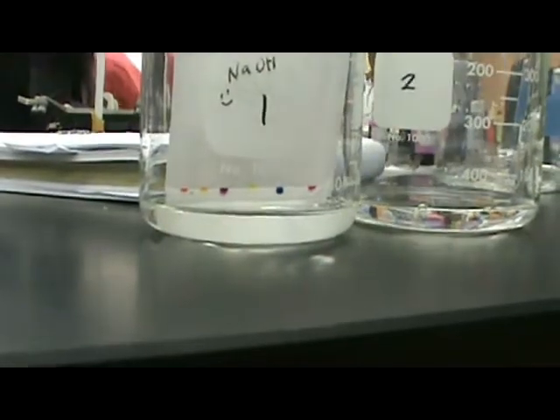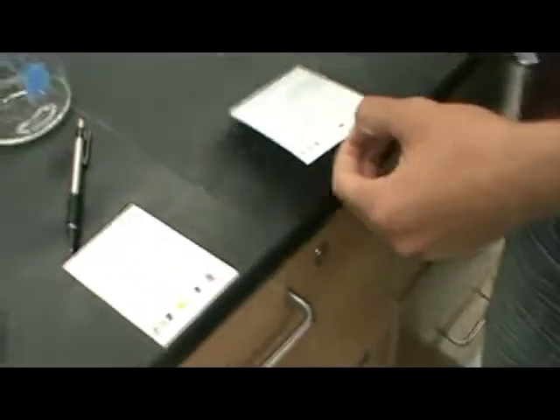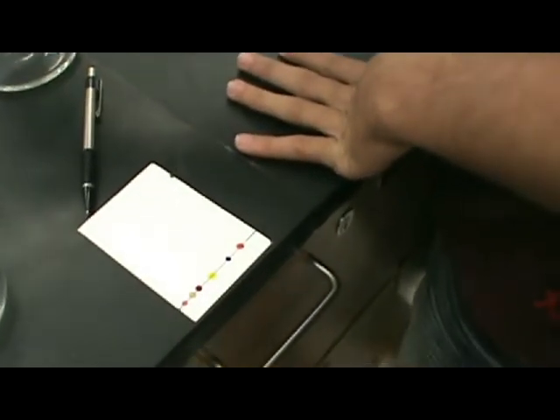And so what we do is we put our papers in there first, right? Make sure the sides don't bend. If they bend, we have a problem. Have you filled yours up yet? Yeah. Is it less than a centimeter? Yeah. Might want a little more than that though. Why? Because it should be right on the line.